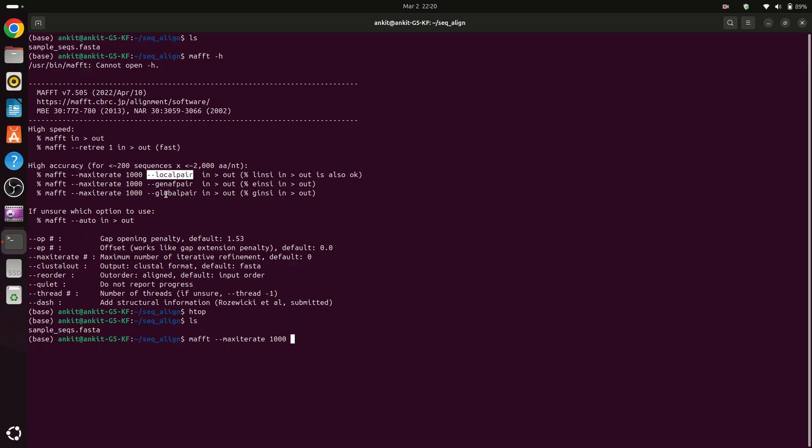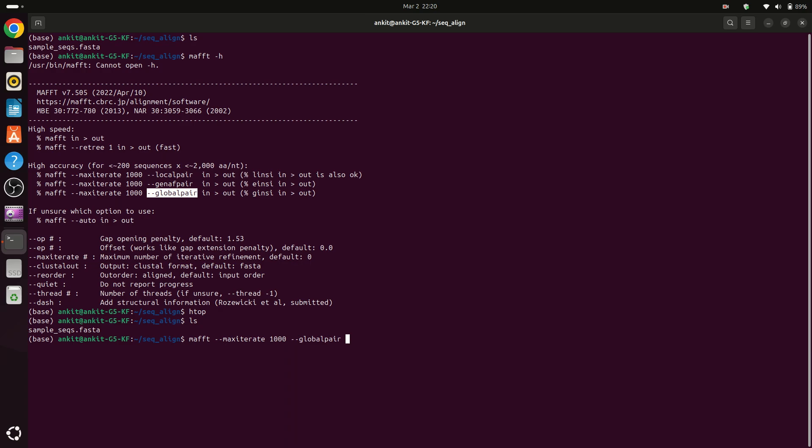Localpair for local alignment and globalpair for global alignment, and I am assuming that you know what is local or global. So for example we will do here global alignment.